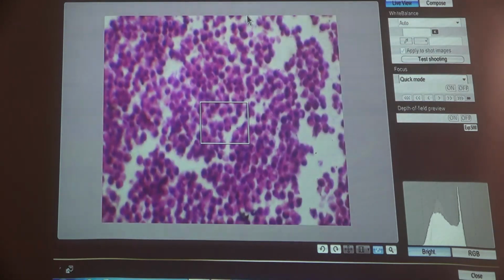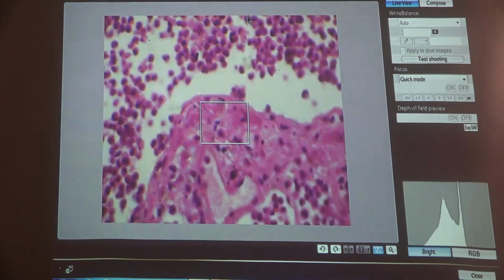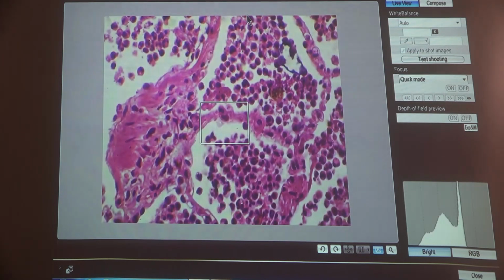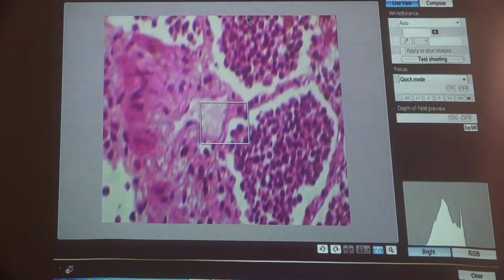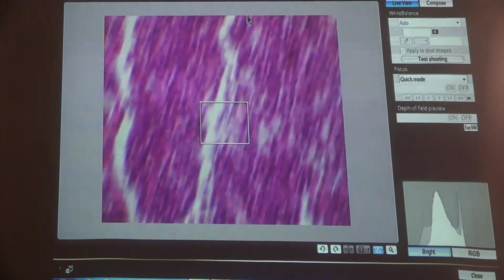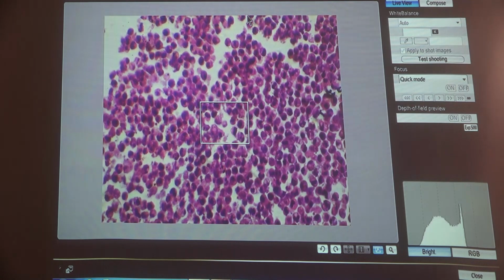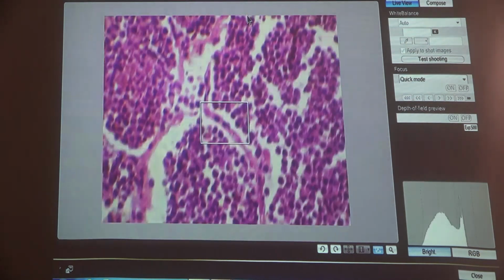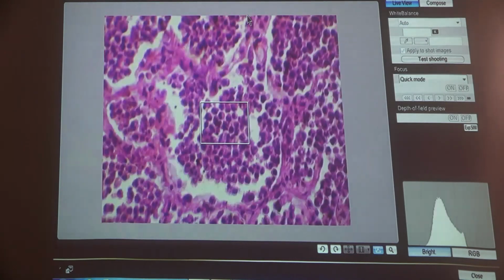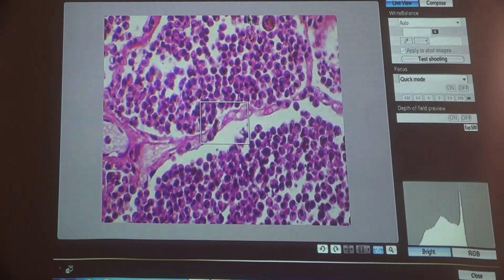This is the marked infiltration with acute inflammatory cells. These alveolar spaces all are filled with inflammatory cells, pus cells. This is gray hepatization of the lung tissue. It is different from red hepatization because there is little number of RBCs, while in red hepatization of the lung, there is more congestion, edematous fluid, many RBCs, and many neutrophils. This is gray hepatization of the lung tissue.